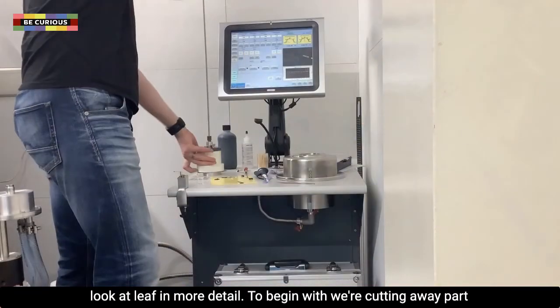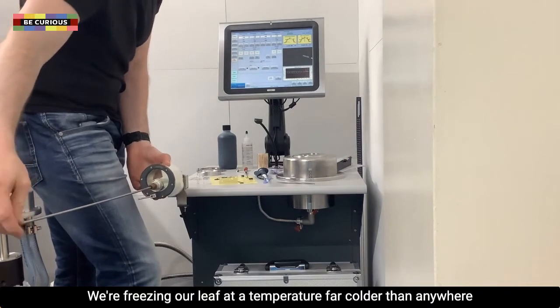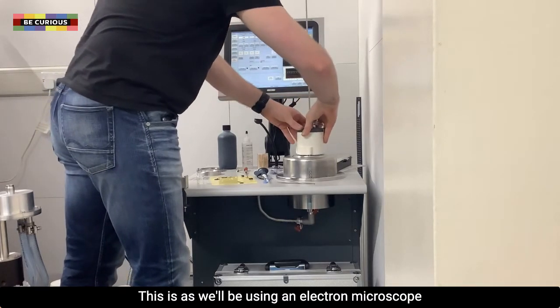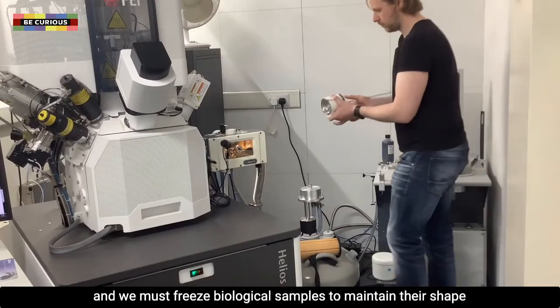To begin with, we are cutting away part of this leaf to prepare it for a special type of microscope. We are freezing our leaf at a temperature far colder than anywhere we get on Earth, to approximately minus 200 degrees Celsius. This is because we will be using an electron microscope and we must freeze biological samples to maintain their shape and features.